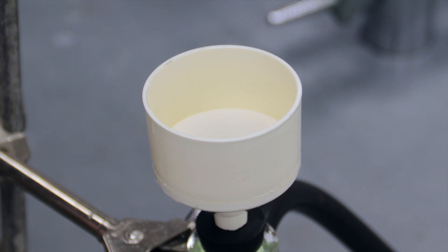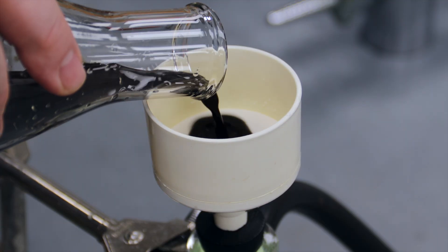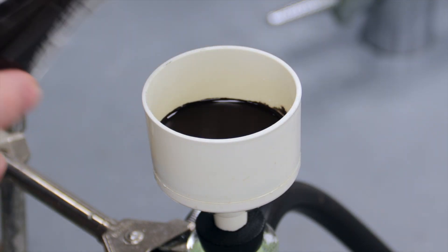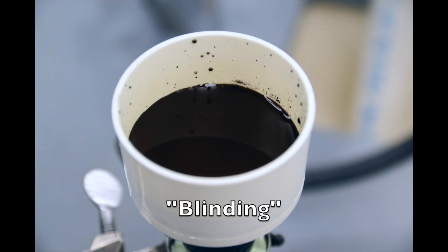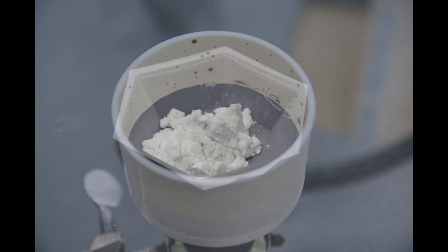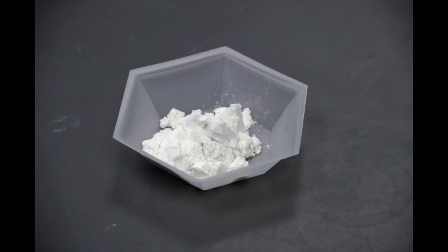If we attempt to filter those particles out with just a piece of filter paper, the pores of the paper will get clogged up, and no more liquid will flow through the filter paper. We call this blinding, which will bring your vacuum filtration to a screeching halt. This is where filter aid comes into play. The filter aid allows us to collect the fine particles of powder in the filter cake before the particles ever make it to the filter paper.